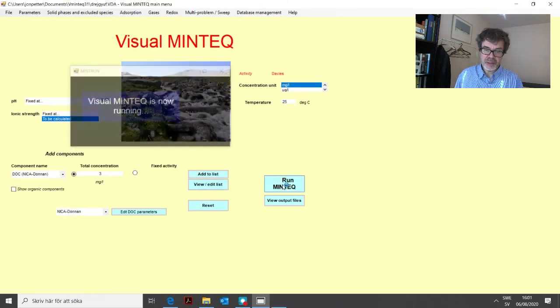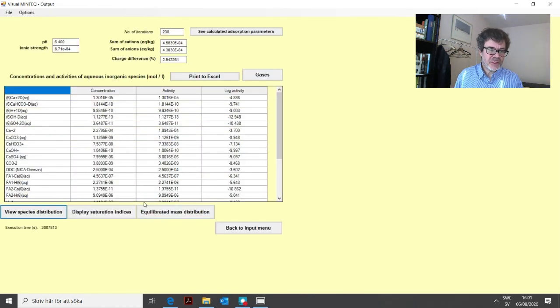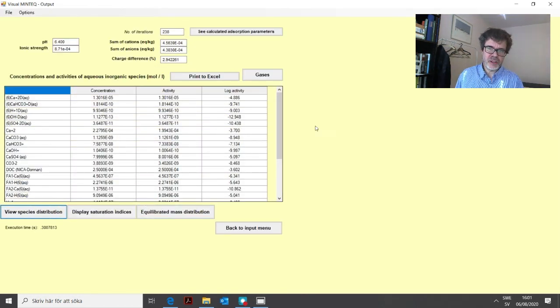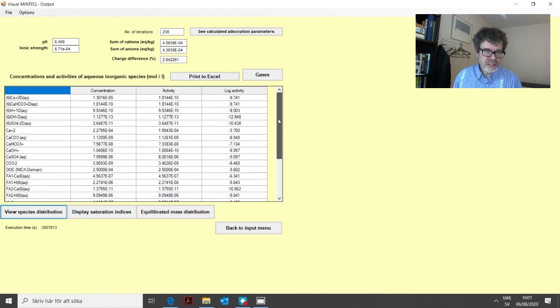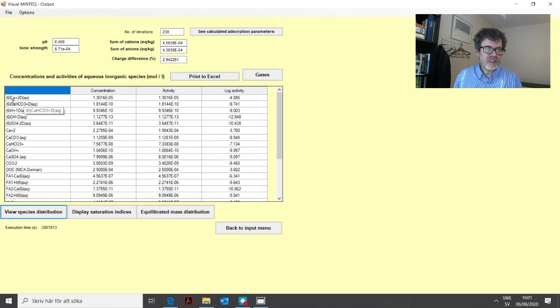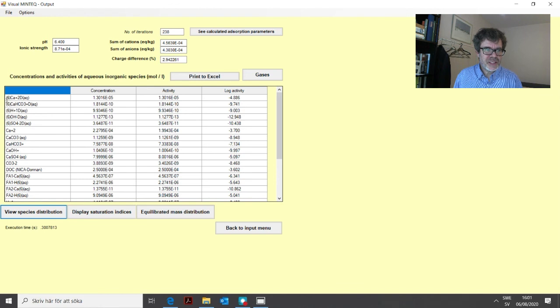We go back and now if you click edit list. Yeah it's the same here. You have DOC but you also have some other funny looking components they are needed for the program to work so don't delete them. So then we can run again and you get another set of results but which are rather similar but these organically bound species look different for this model. So for the NICA-Donnan model you see this parenthesis six strange looking species here. These are actually weakly bound electrostatically bound species in the gel phase of the organic matter.